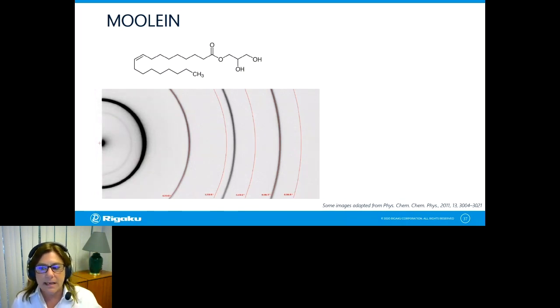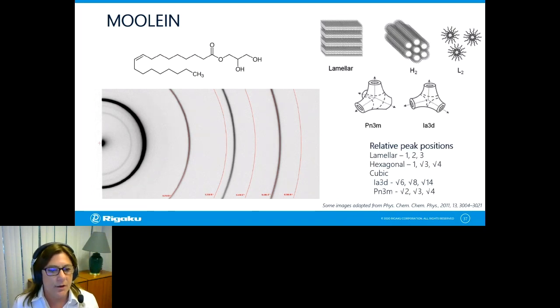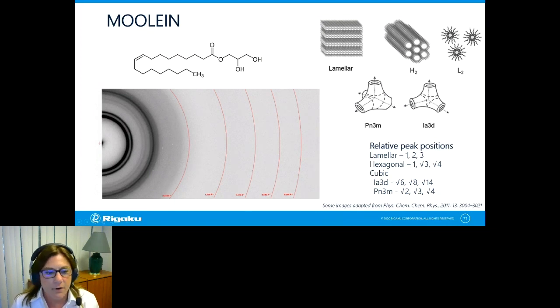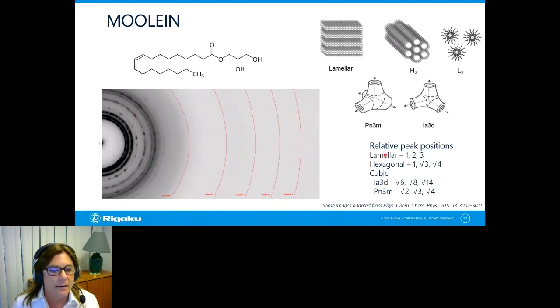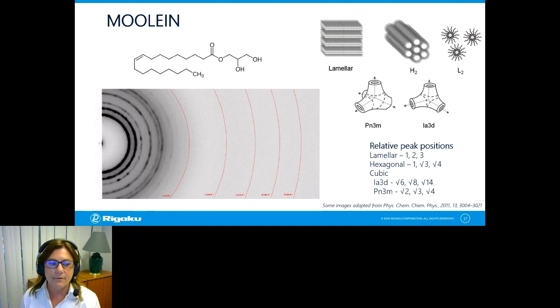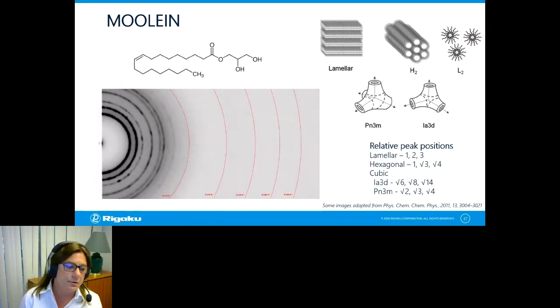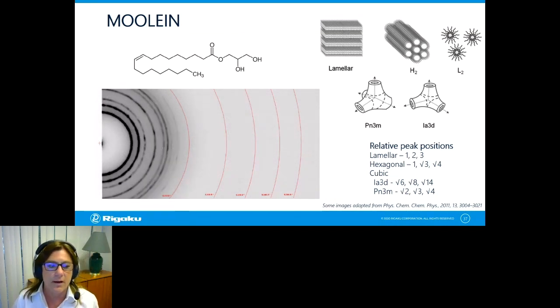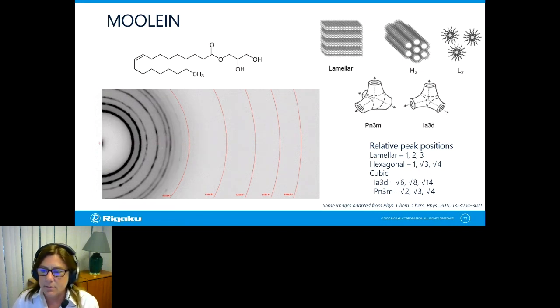So here I'll show you the example results for that. So it's just a quick movie, and we're ramping from minus 10 degrees up to 90 degrees, and we can start to see the phase changes. And if we want to understand the phase changes, then we can refer to the relative peak positions that we see in our plots and determine whether we have a lamellar phase, hexagonal, or perhaps a cubic phase. There are actually a couple of other phases that we see, but only when we add other things like salts or other detergents. So you see, we can clearly explore this space, and then we can make a different mixture and look at that as well.